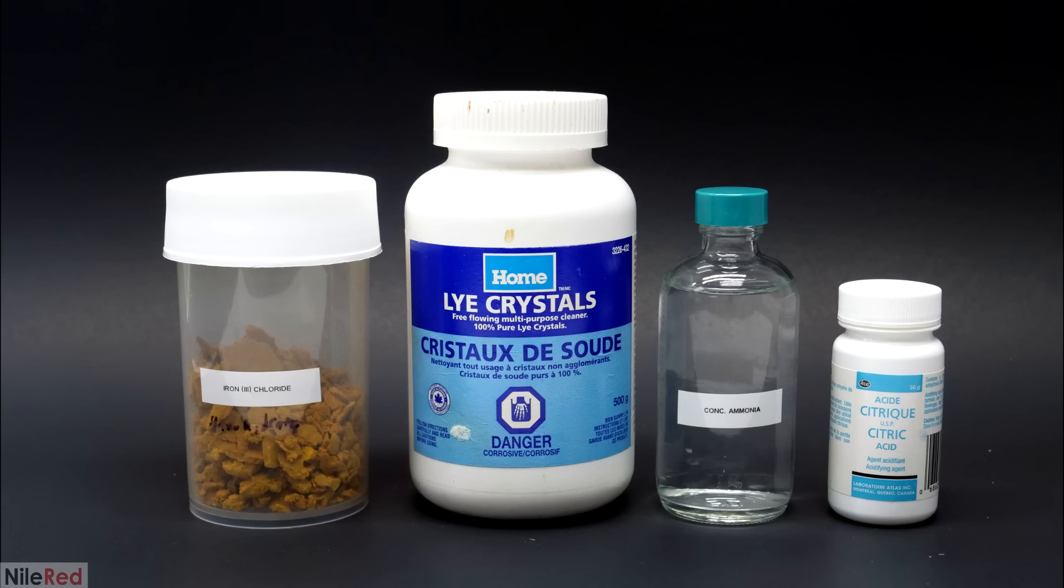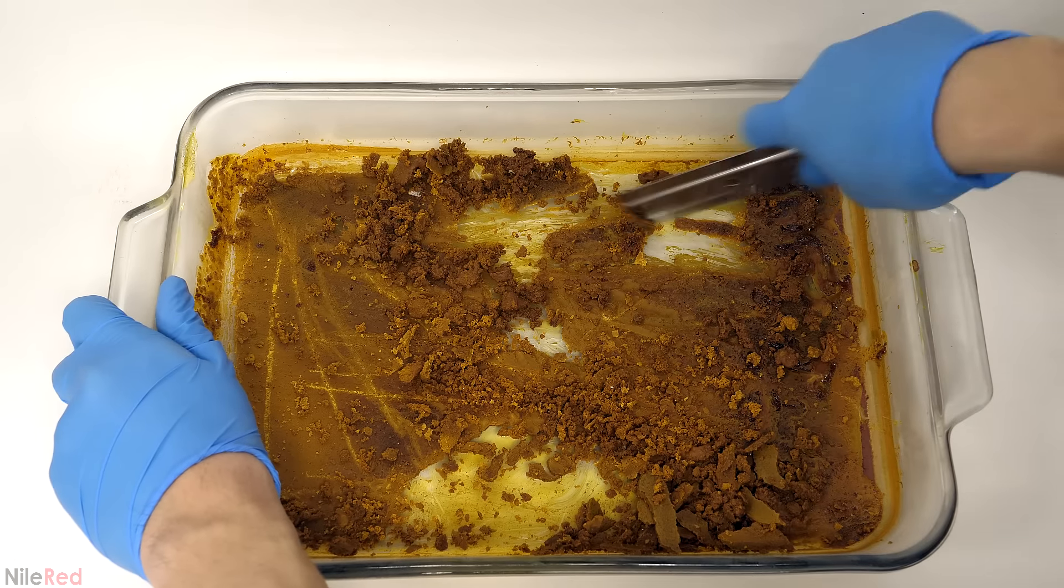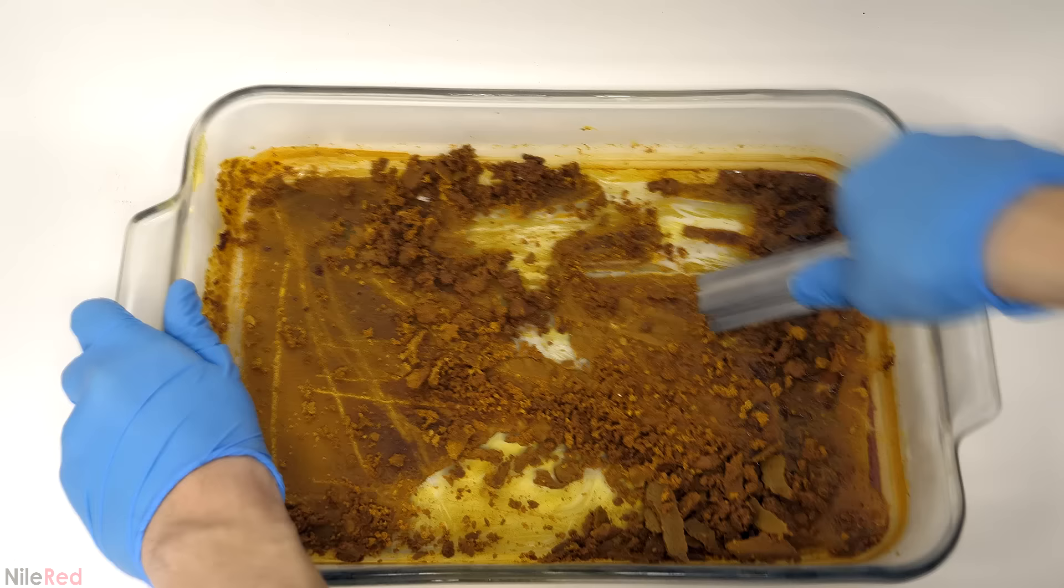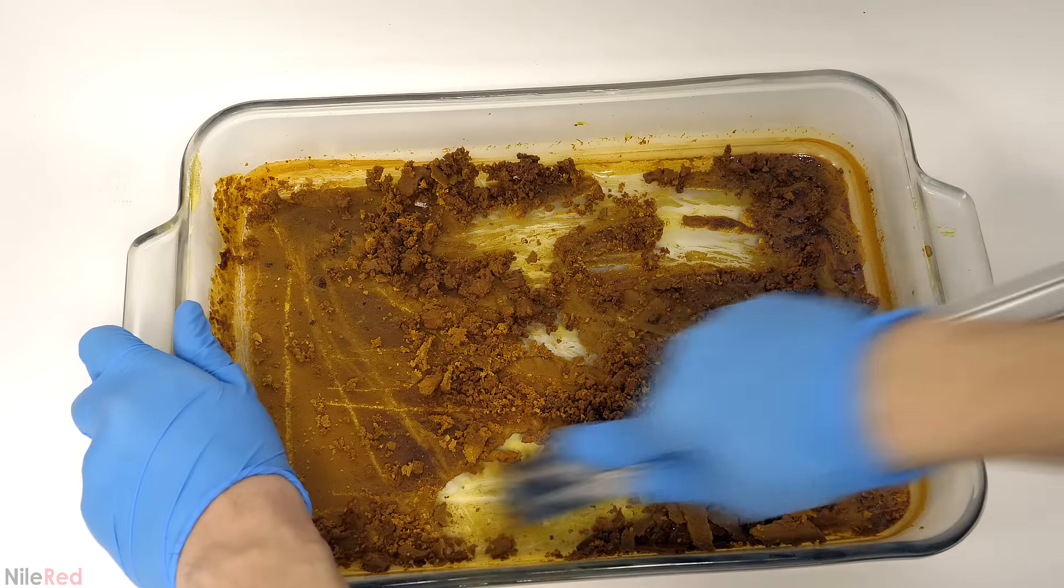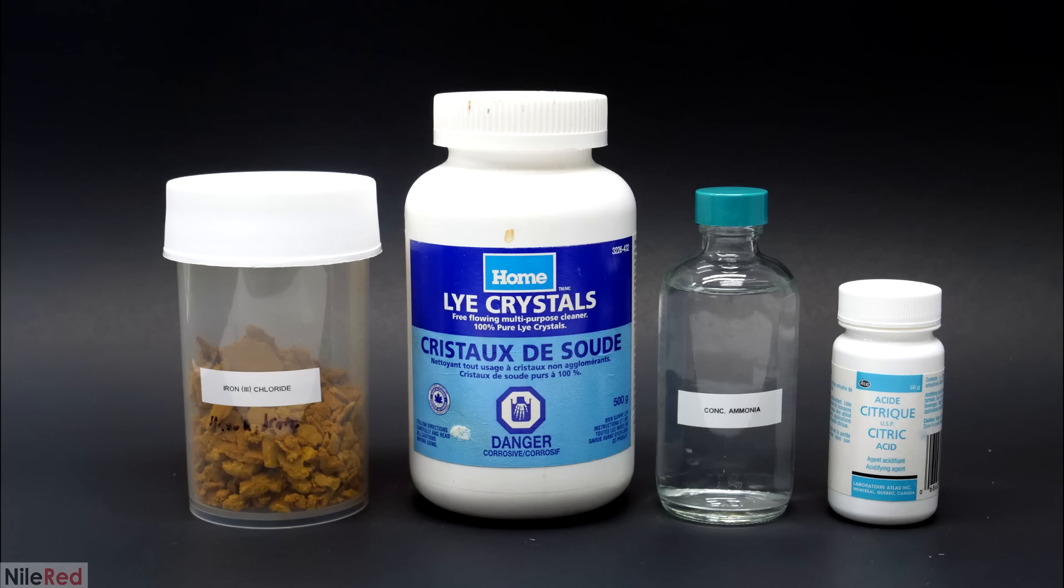In terms of chemicals, I'll be using ferric chloride, sodium hydroxide drain cleaner, ammonia solution, and citric acid. I made the ferric chloride from scratch in my Prussian blue video starting with acid and steel wool. The citric acid and sodium hydroxide drain cleaner were purchased locally, but I got the concentrated ammonia solution online. In hindsight though, I probably could have just used ammonia cleaner from the store.